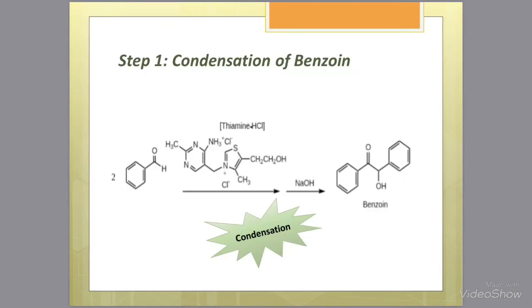This reaction has a complete atom efficiency, where all atoms in the benzaldehyde will remain present in the product. Make sure that the benzaldehyde used is a freshly distilled benzaldehyde because it's easily oxidized to benzoic acid, and this can prevent the desired reaction from happening.